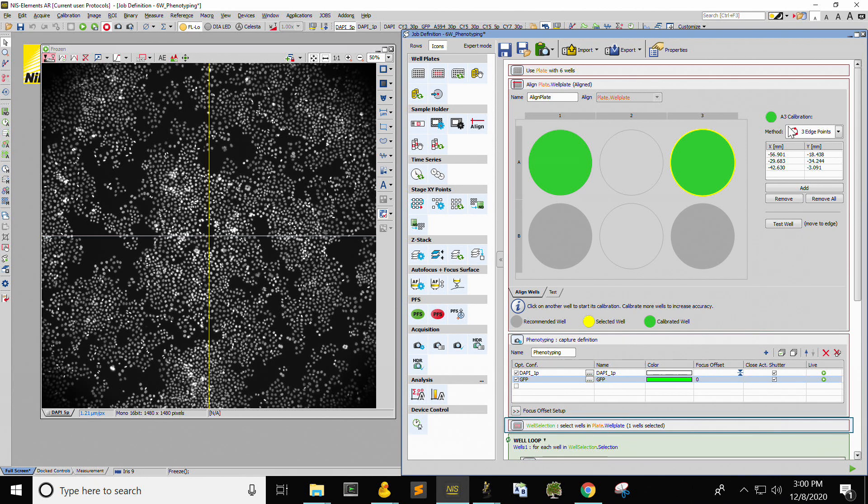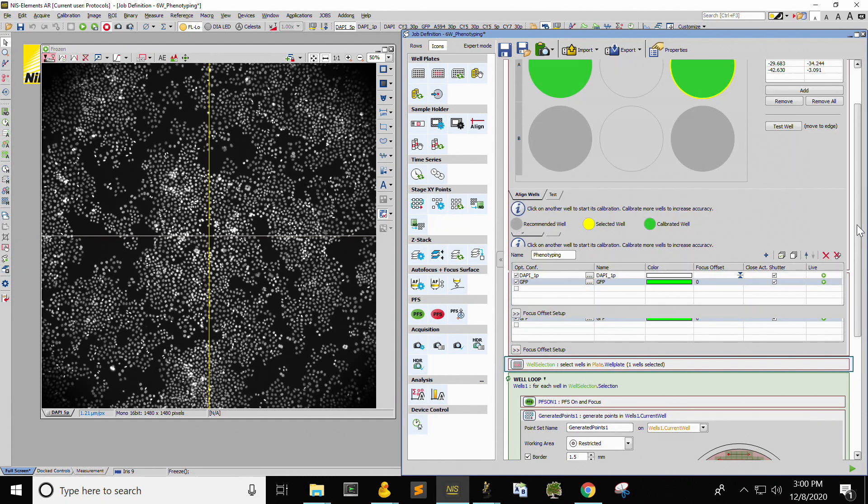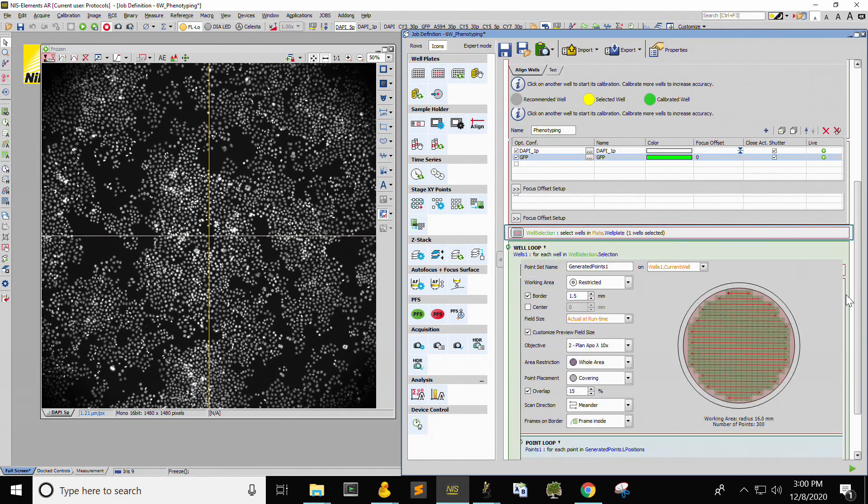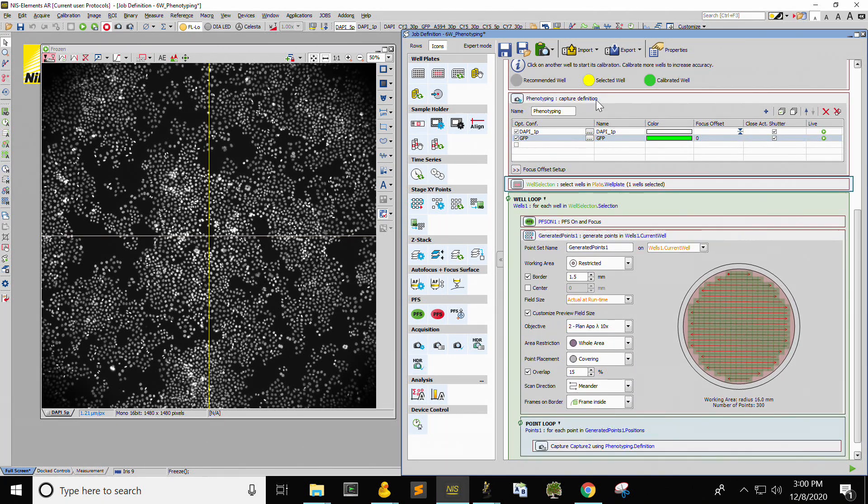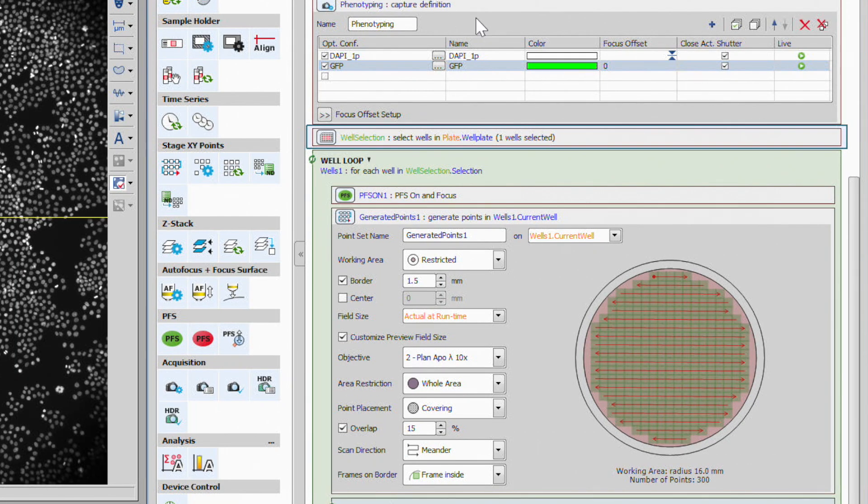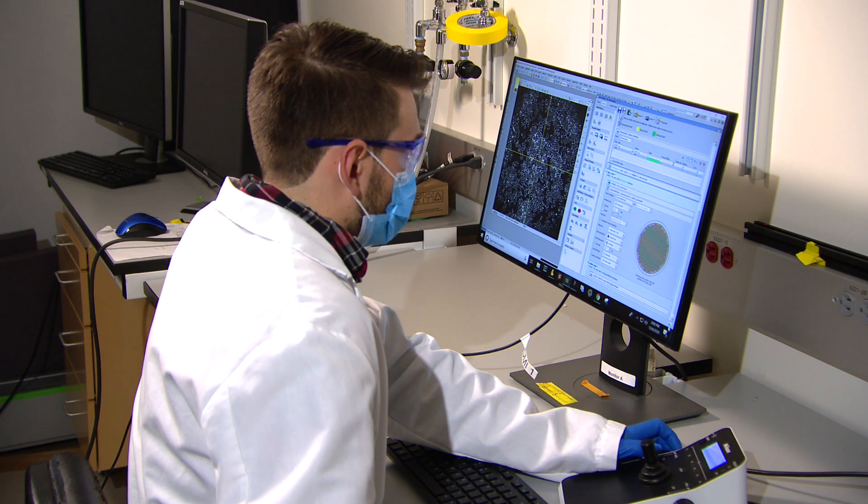For the first round of imaging, which is generally phenotyping, configure a phenotyping job as shown. Align the plate using three edge points in two or more wells. Set up the channels and imaging grid as needed. Focus the sample and initiate imaging.